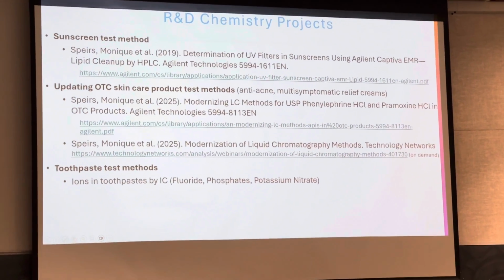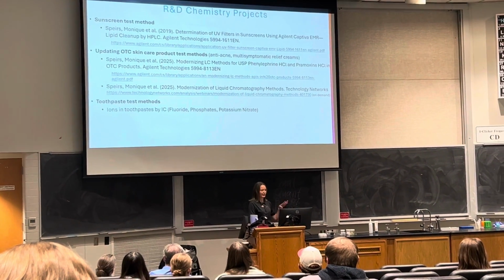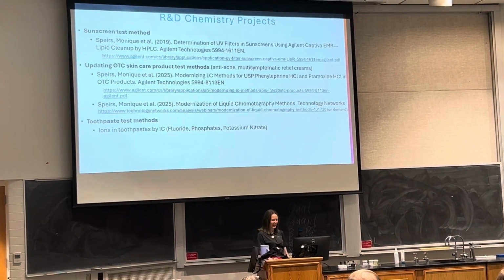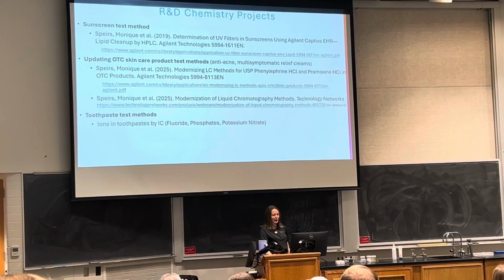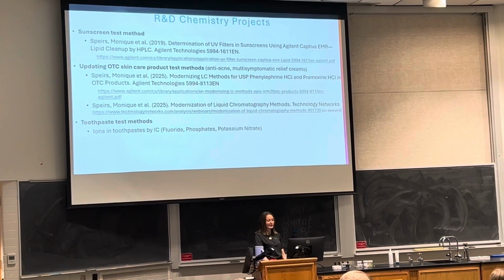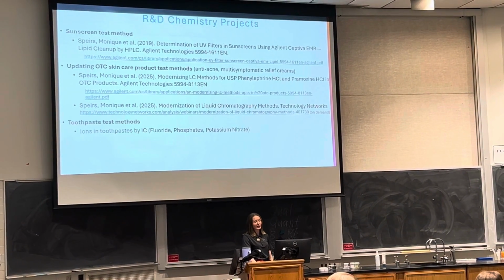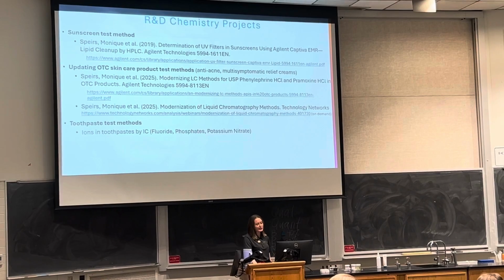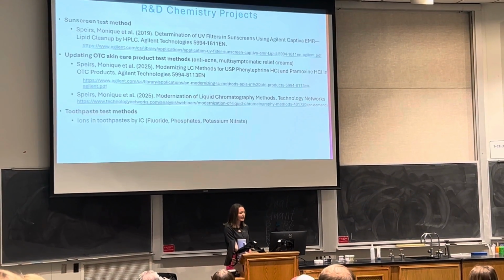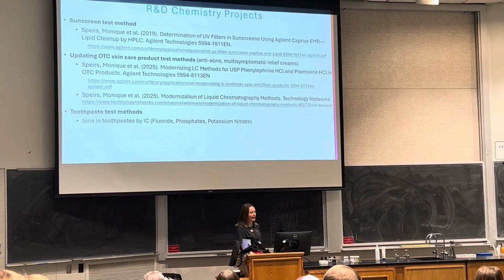I developed and transferred methods to test the active ingredients in toothpaste, including this lovely Nuskin AB24 whitening fluoride toothpaste that you can take home with you today. And I developed methods to screen, which is just another way to say test for trace levels of contaminants, APIs, active pharmaceutical ingredient adulterants, and dietary supplements. And currently, I'm working on a screening method to analyze pesticide residues in botanicals by LCMS. And I'll show you where I'm at in that process.